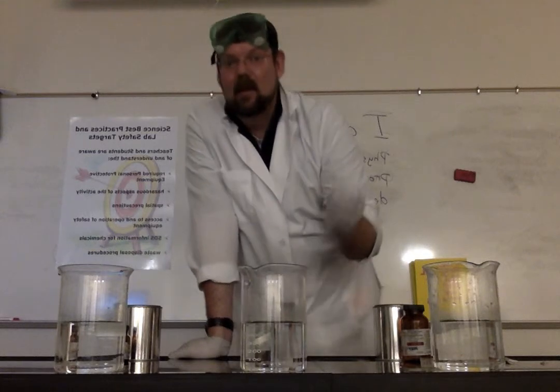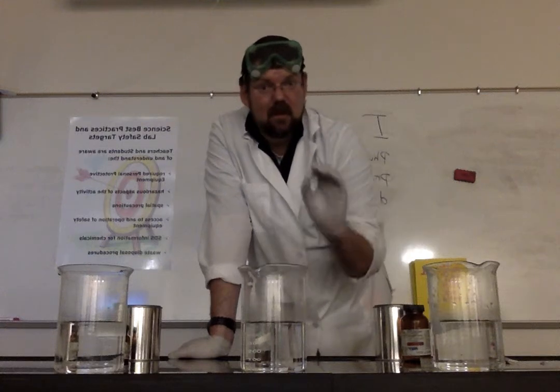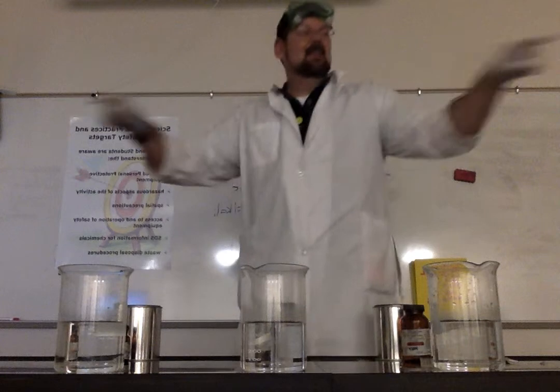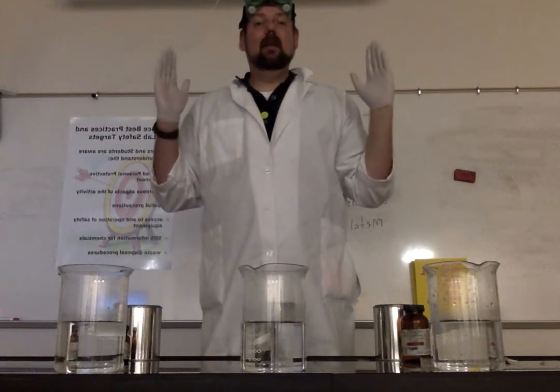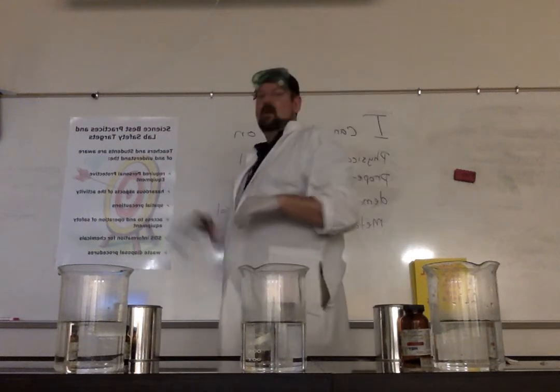Okay? Now, since these are so highly reactive, we have some safety precautions we have to take. First is for you. You'll notice that you're standing behind a line. This line says student line. You are not to come in front of that line. This gives me a buffer. As it states here, I have spatial precautions.